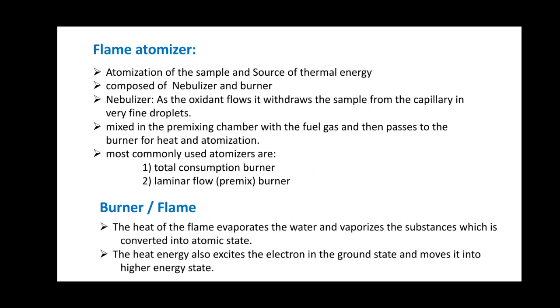The flame atomizer, a component of flame photometry, is for atomization of the sample and is the source of thermal energy, and it is composed of a nebulizer and burner. The nebulizer, as an oxidant flows, withdraws the sample from the capillary in very fine droplets and mixes it in the pre-mixing chamber with the fuel gas, and then it passes to the burner for heat and atomization.